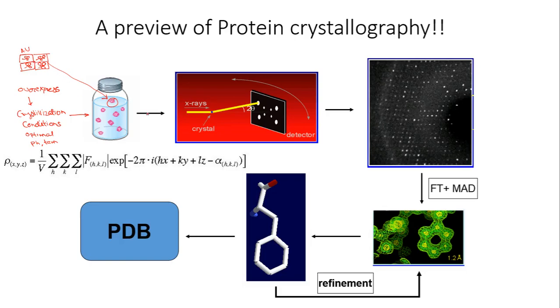Okay, so now say you have obtained your protein crystals by any of the methods like the hanging drop technique. One more thing, when I show this image to my students, they tend to get an idea that these crystals might be very big, like you might mount it on a ring, but that is not the case.